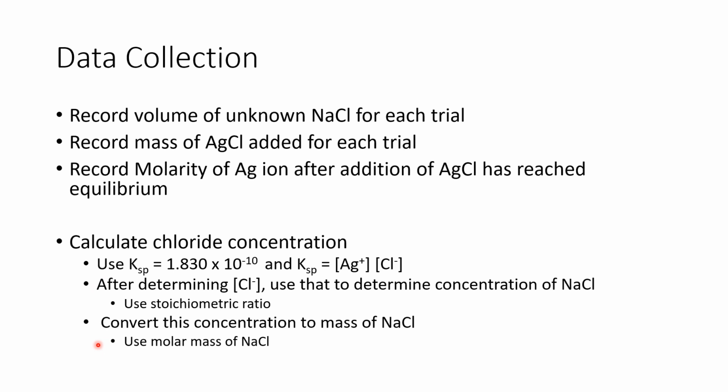And also in there, in order to get the mass in grams, you will have to multiply by that original volume you recorded. So each piece of data that I have you record is important, especially that volume of your unknown NaCl, and also the concentration of the silver ion that you're recording, this one.